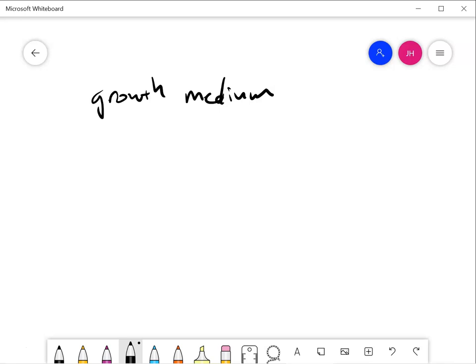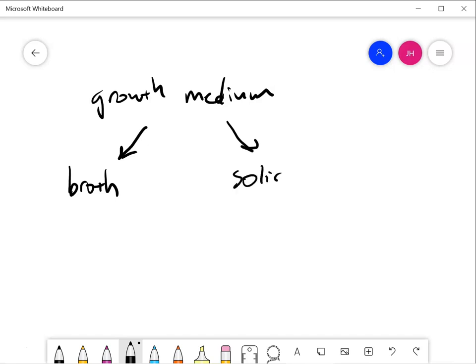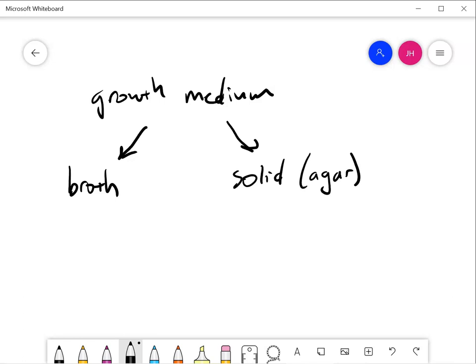We have two options for growth medium. We can have broth, that's just the growth medium in water, or we could have solid media. Solid media is just broth with agar added to it. Agar is a carbohydrate, when you heat it up it dissolves in water and then when it cools down again it solidifies the water.